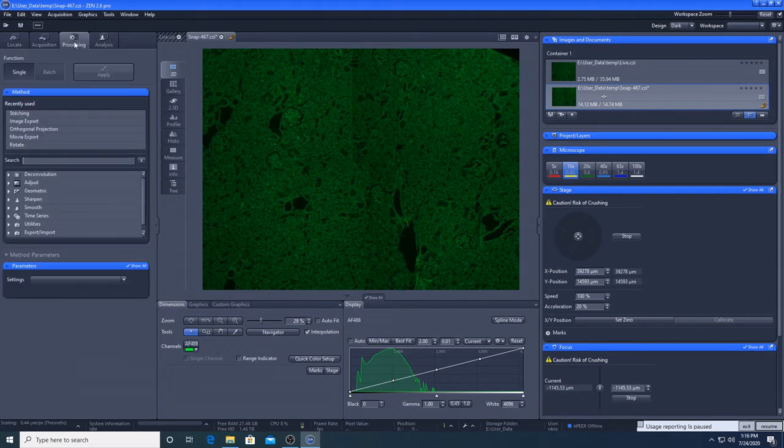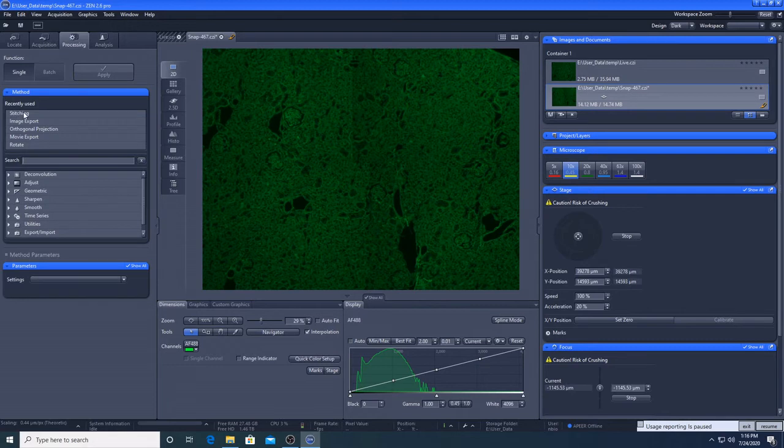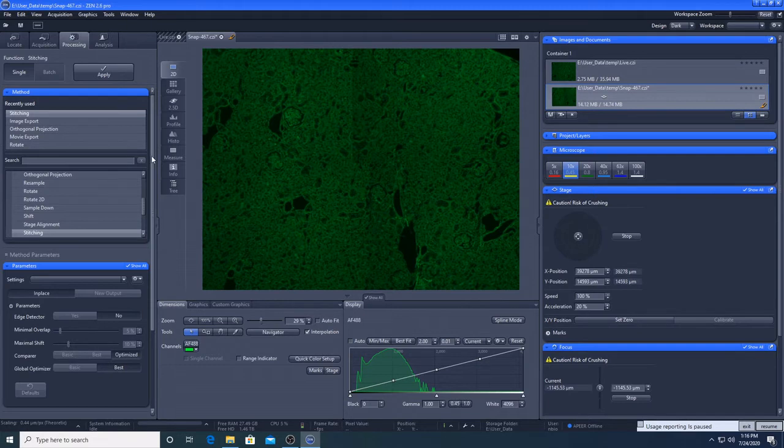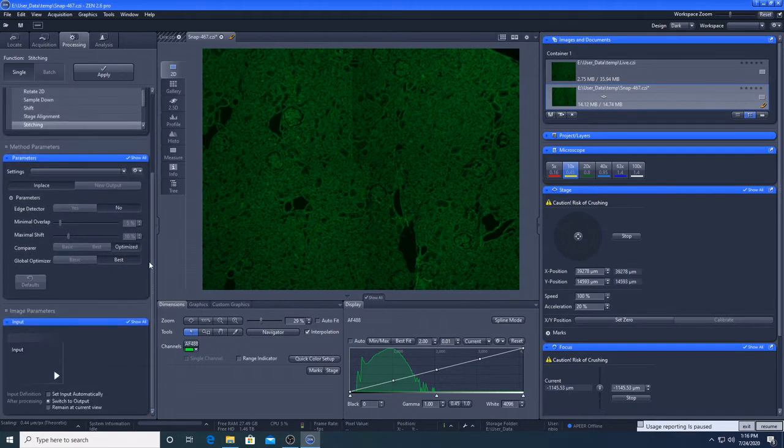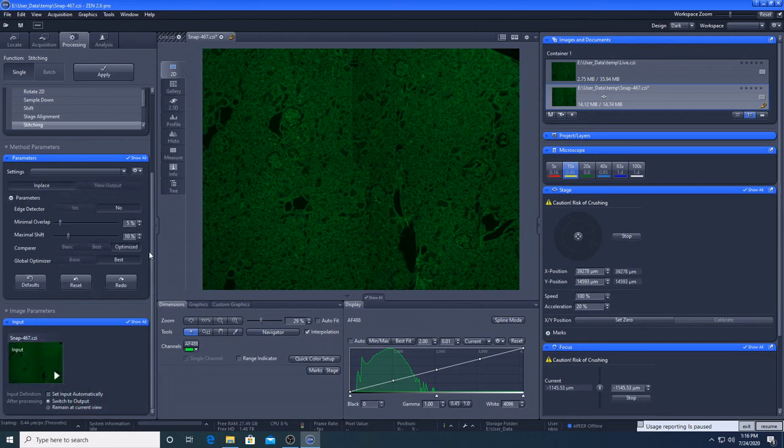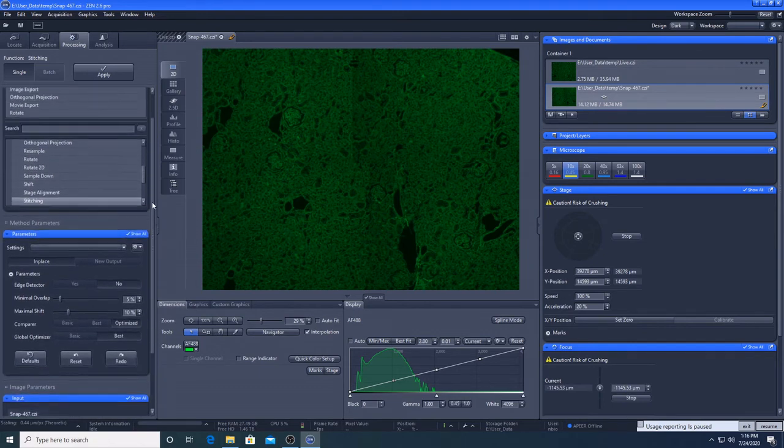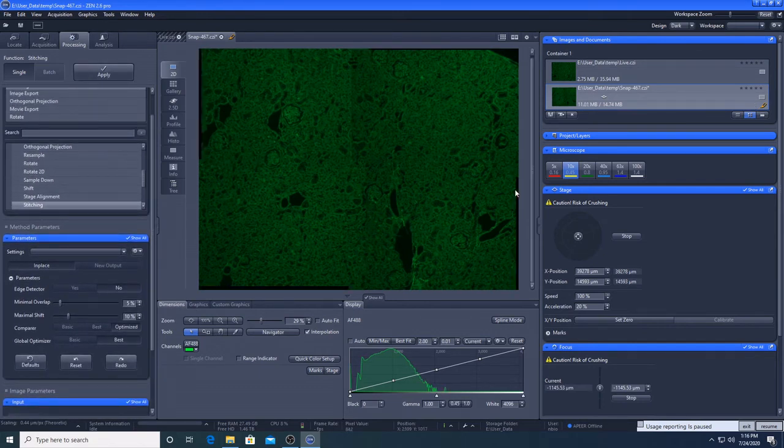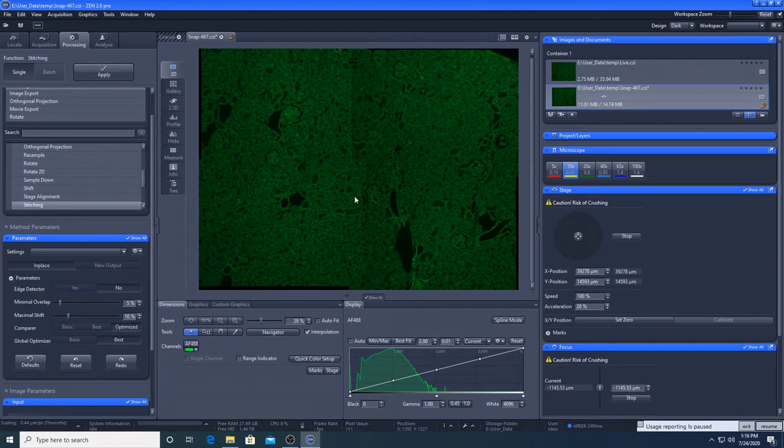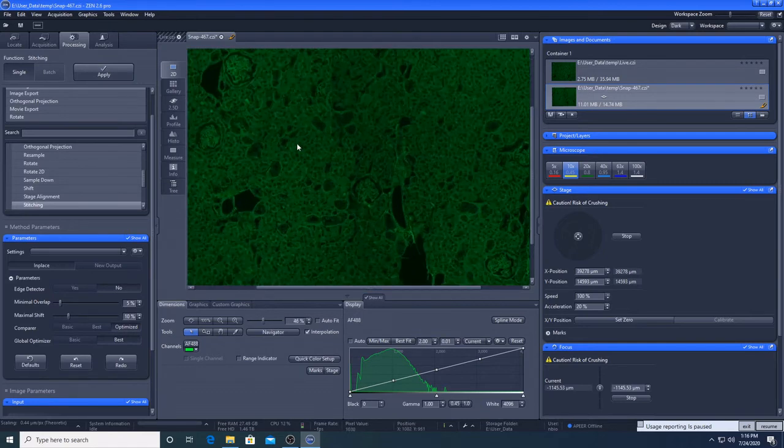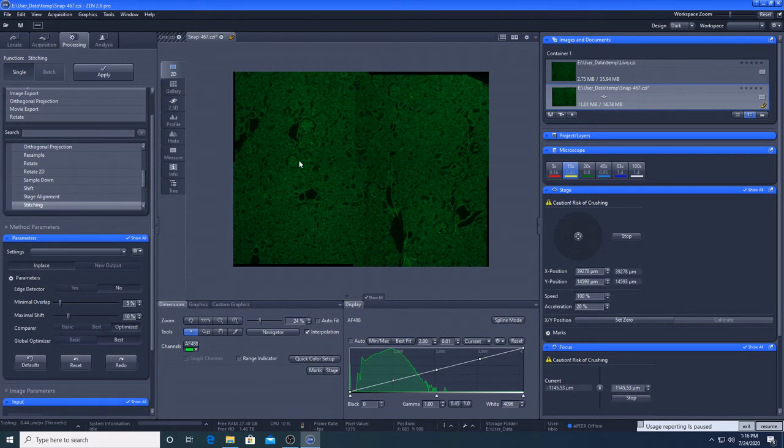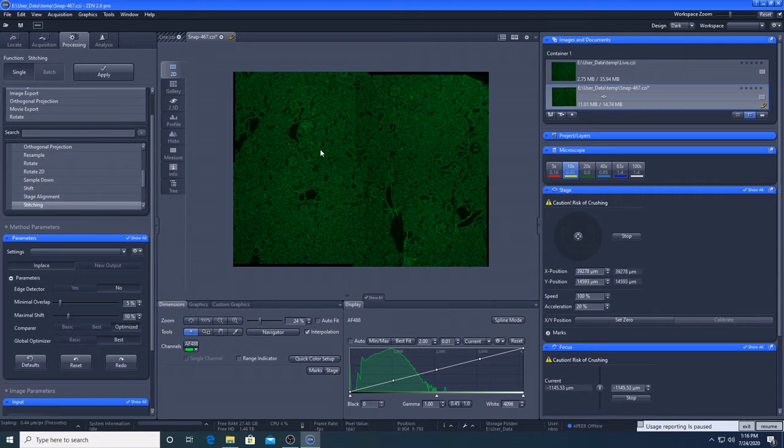If I wanted to stitch those together, I could quickly show you the processing. So recently used stitching is always one of the most recently used, but if it wasn't here, you can just type it in here. I'm going to click stitching here. I'm going to select my image down here. I'm going to leave all of the defaults on. I'm going to apply. And you can see that you can still see the joins a little bit on here. But I'm going to leave that for now. There's different methods we can use for optimizing, but I'll come back to it.